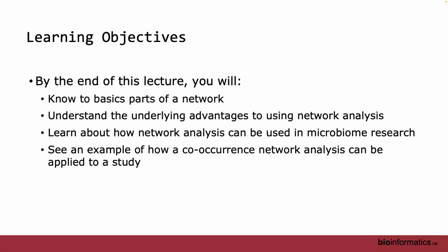First, the learning objectives for this slide, if we have time to get through all of it. I'll try to keep us to the time, because I don't want to overload and I want us to have time to actually work through the workshop part, or the lab part. I'm just going to talk to you a little bit about the anatomy of what a network is, and more generally what a graph is. I want you to understand the underlying advantages of doing a network analysis versus some of the things that we already did, and other types of correlation analyses.